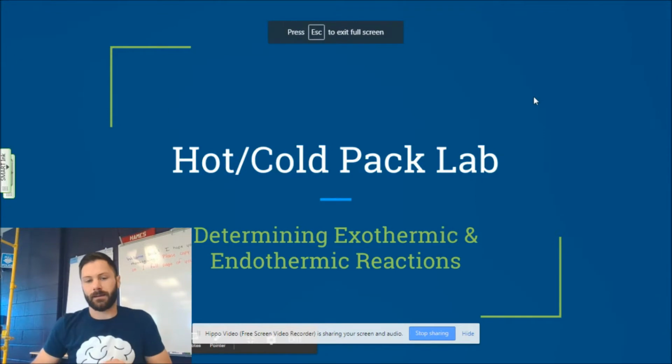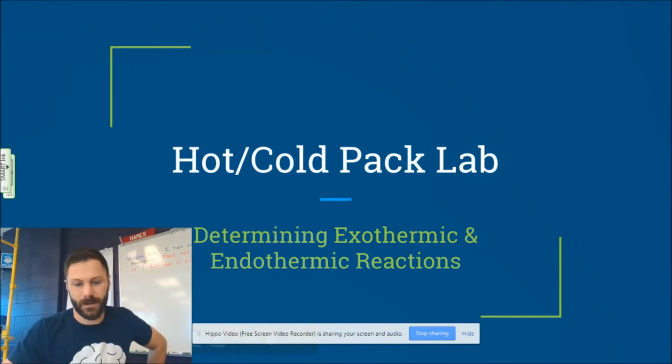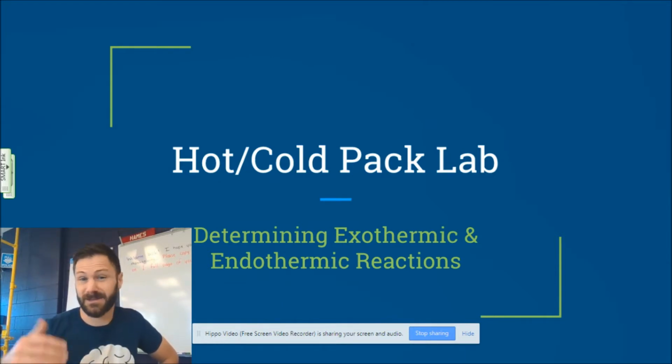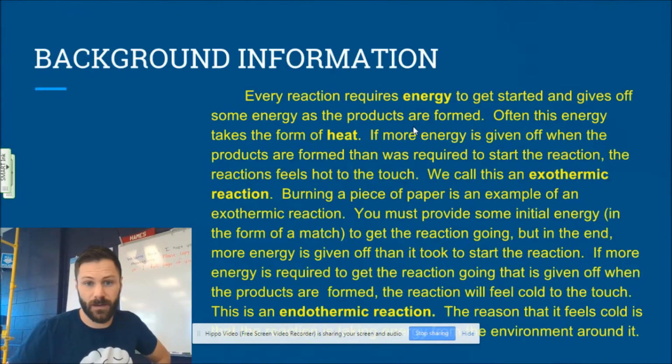So hot cold pack labs, the whole idea of this is we're trying to determine the difference between an exothermic and endothermic reaction, which shouldn't be a new concept. We talked about this a lot towards the end of our chemistry unit. You experienced an exothermic reaction when you felt the test tube during the hydrochloric acid and zinc reaction. It became hot. This is an exothermic reaction.